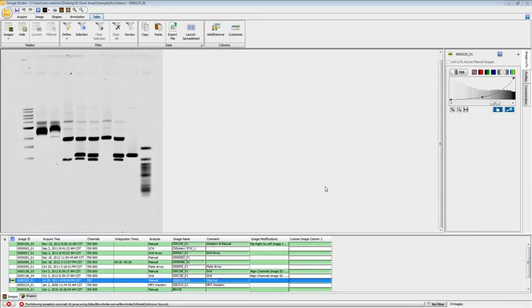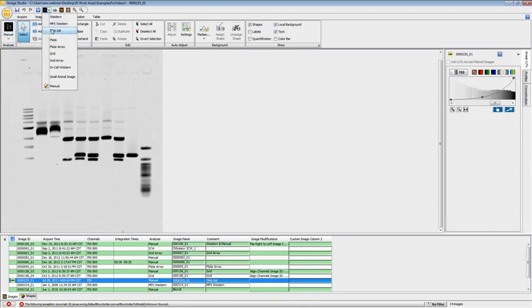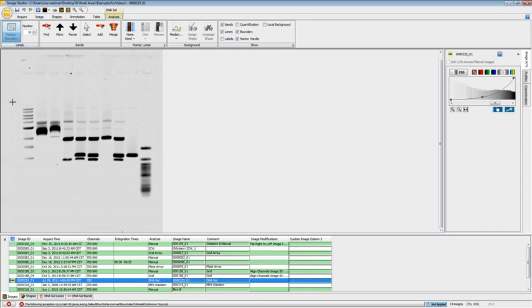In this video, I'll be going over how to analyze a DNA gel using the Image Studio software. Now, if you did not set DNA analysis as your analysis type when you did the image acquisition, under the Shapes ribbon, you can choose DNA gel, or that can also be accessed through the Quick Start menu up here by choosing DNA gel. And so what you'll more than likely need to do first, under the DNA gel analysis ribbon, is to click on Redraw Boundary.